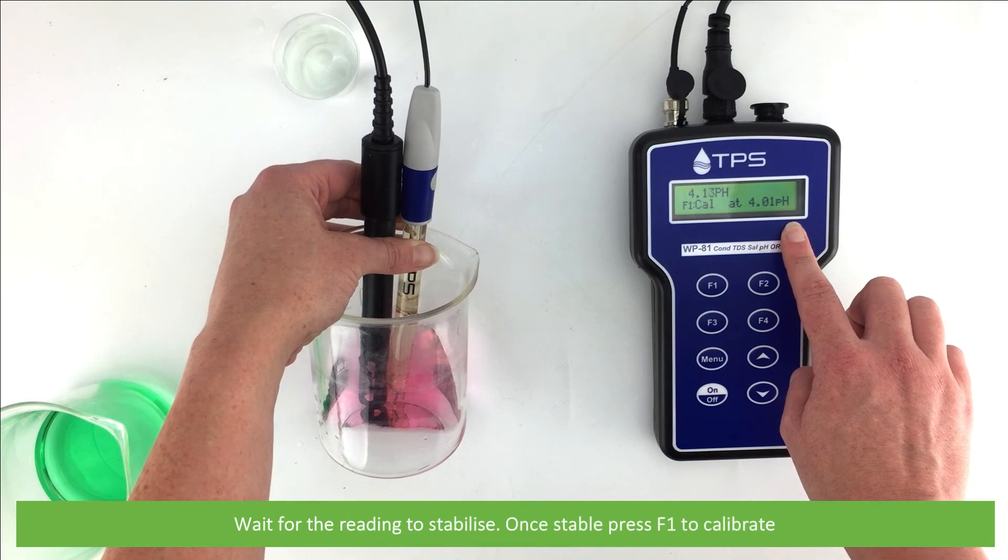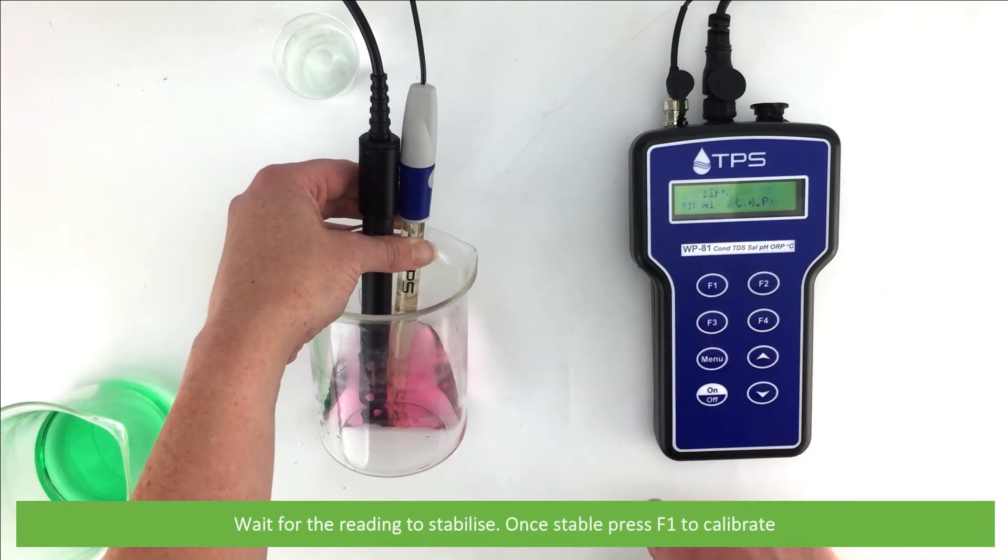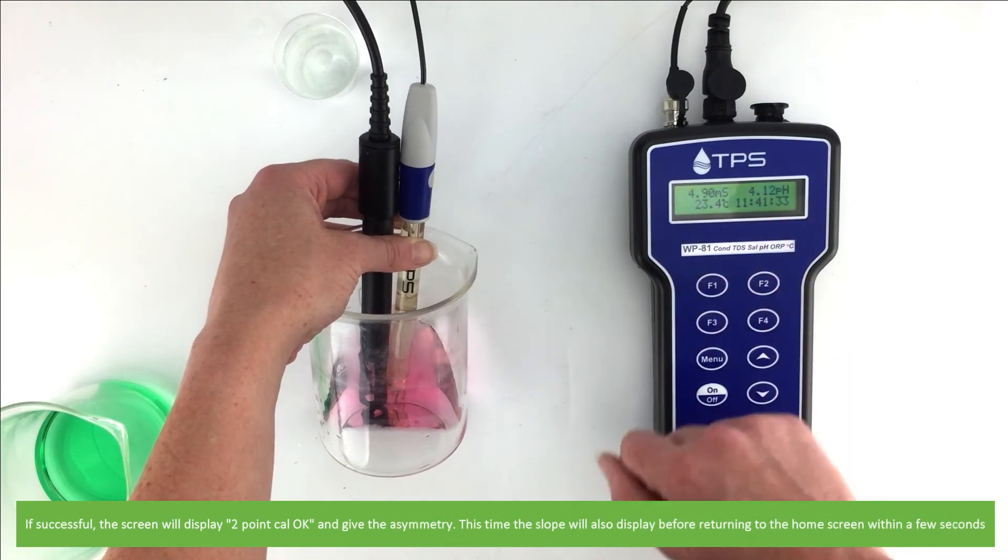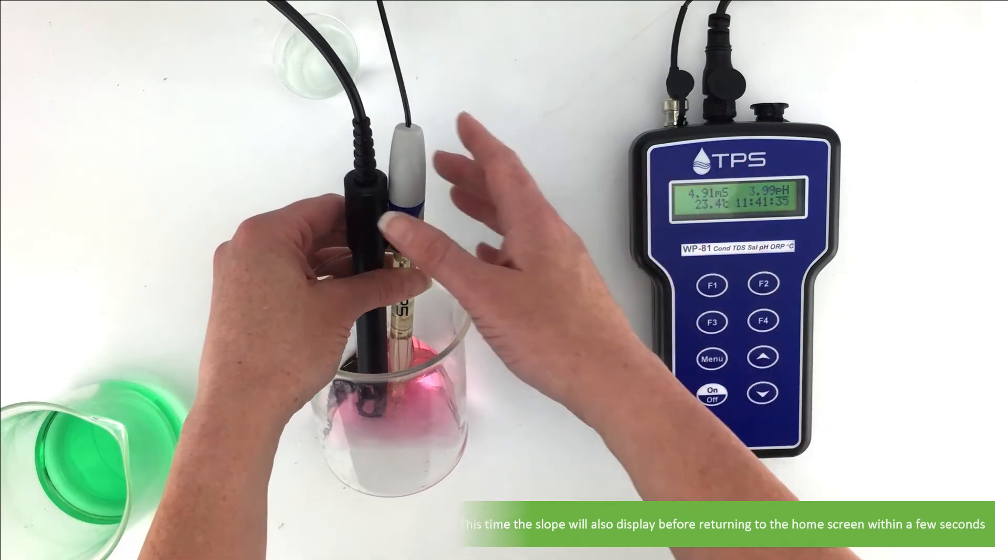Wait for the reading to stabilize. Once stable, press F1 to calibrate. If successful, the screen will display 2.Cal OK and give the asymmetry. This time the slope will also display before returning to the home screen within a few seconds.